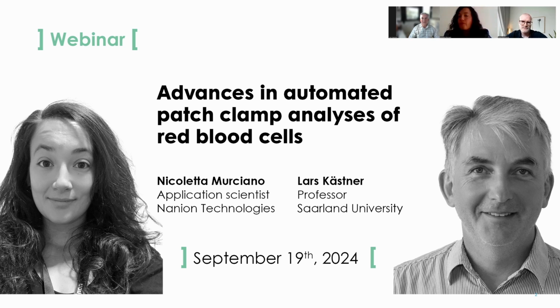And I think just last year I came up with the term pseudo action potentials, and I haven't heard this in any other cells, and I would doubt that other cells have it, because of the low copy number of the channels, which is essential for this flickering. I think it does not occur in cells that have a translational activity. So I think this could be something very special about red blood cells.